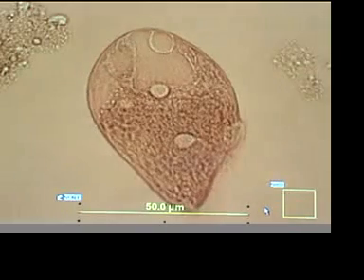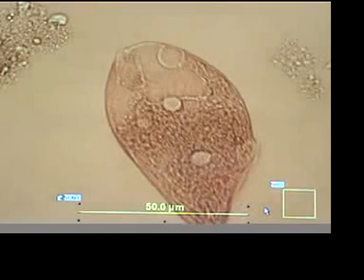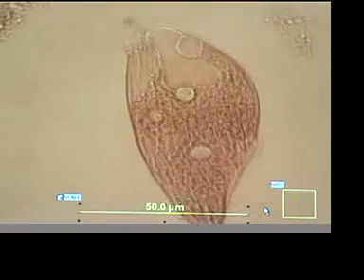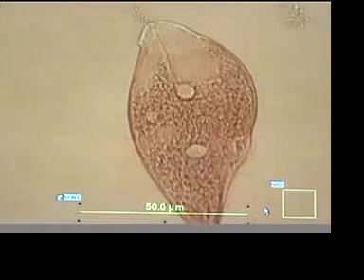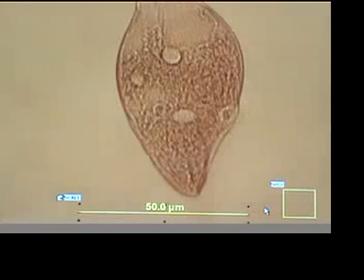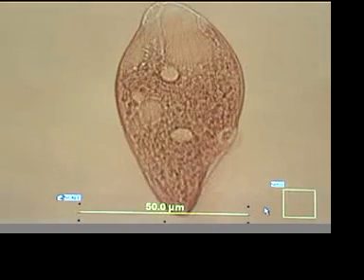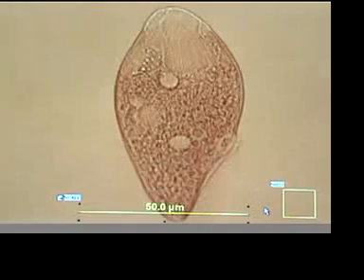We seem to be getting some dissolving granulation in here. We'll follow this organism as he continues to move here. Kind of surprising me that he is capable of movement. Which might mean that we don't have the right frequency, but the internal structures look pretty different here now.